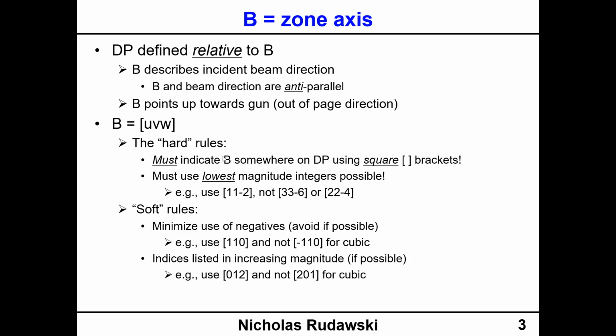You might look at that pattern and say, okay, I have point symmetry 4 mm for my material, so therefore my cubic crystal must have four-fold rotational symmetry. That's not always the case. So keep that in mind. For instance, if I'm dealing with a zinc blende cubic crystal, zinc blende does not have that symmetry operation.